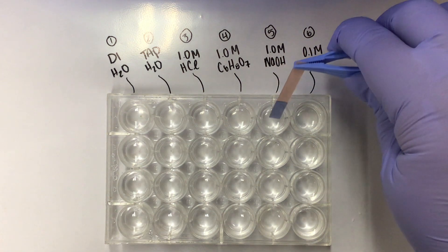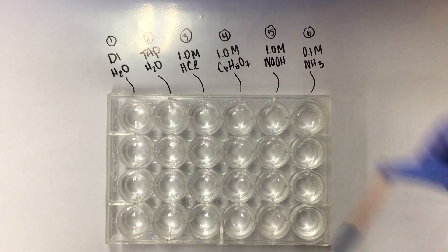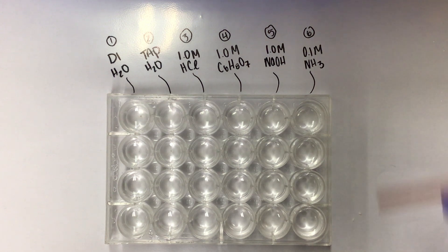Red litmus paper going into C6H8O7. NaOH. And lastly, NH3.